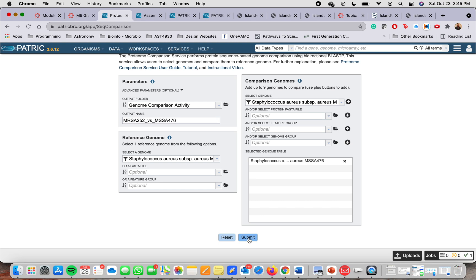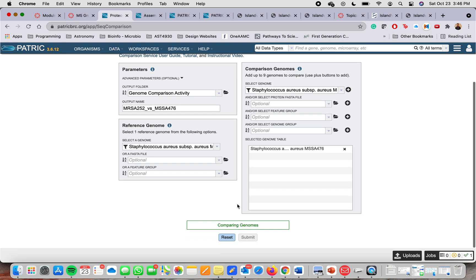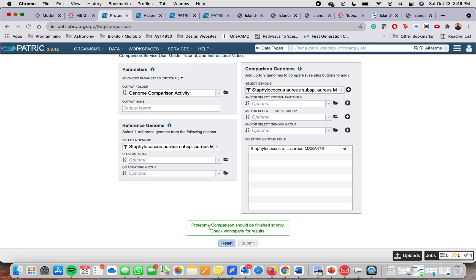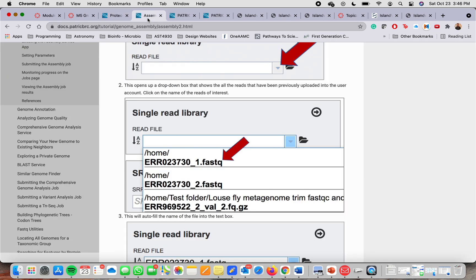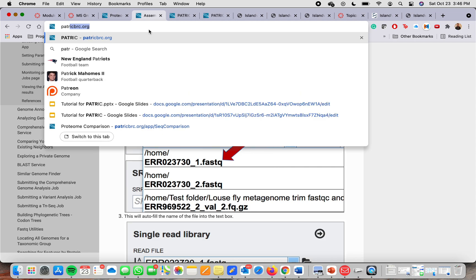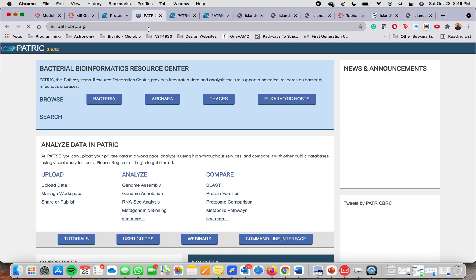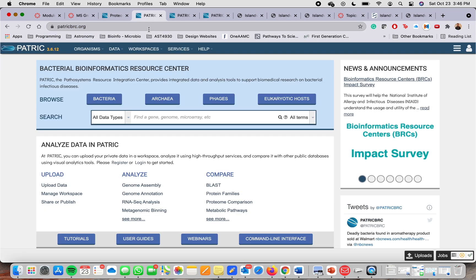And then you're going to click submit. Once you click submit, it will start running. It will start doing the protein comparison. And for you to find it, you can go, if we go to the website again. Let's say that we're in the main website.